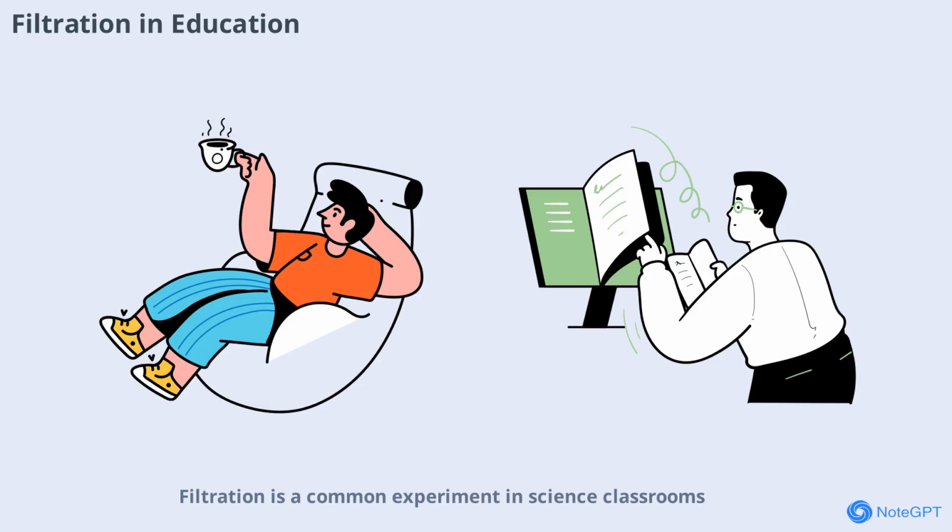Filtration is a common experiment in science classrooms. Students learn about separation techniques by filtering mixtures and observing the results. These hands-on activities help build a strong foundation in scientific principles and laboratory skills.